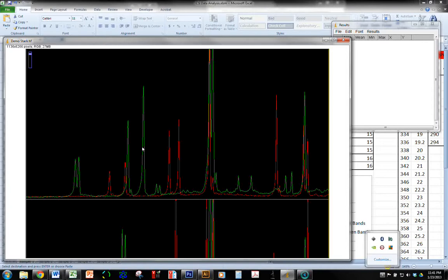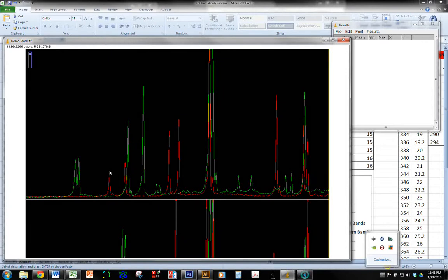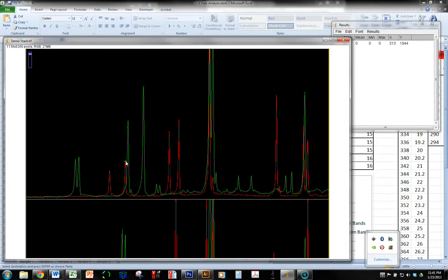And first we're going to collect the red data. So go along here with your little point selector, Control M, Control M, Control M. And you can see it's populating the results window over here with that data. There we go. So we've got 1, 2, 3, 4, 5, 6, 7, 8 peaks.